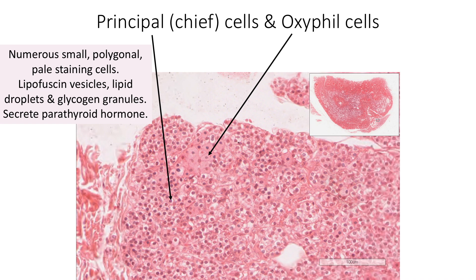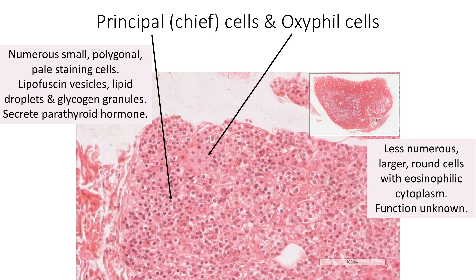These cells secrete parathyroid hormone which helps in calcium metabolism. Oxyphil cells, on the contrary, are less numerous but their number increases with age. They may be found singly or in clusters as seen here. They are larger cells, round in shape with distinctly eosinophilic cytoplasm due to abundant mitochondria. Their function is currently not very well known.